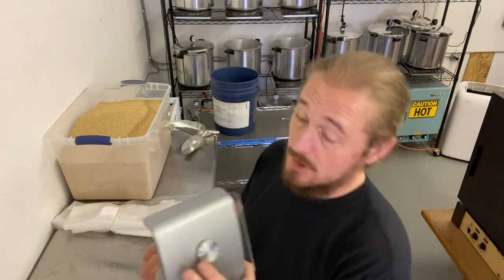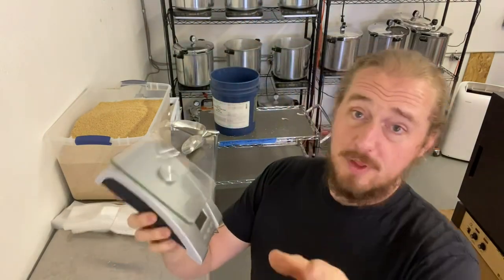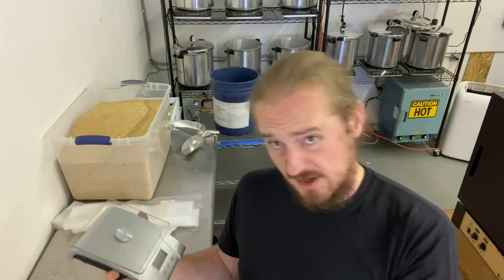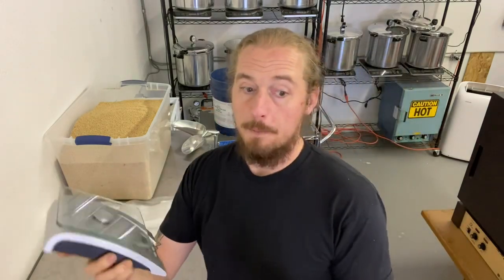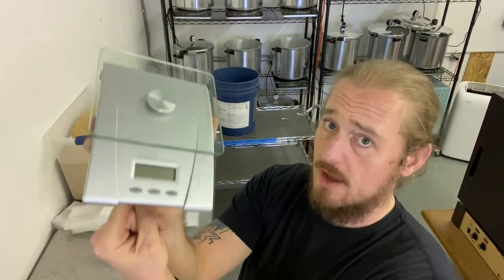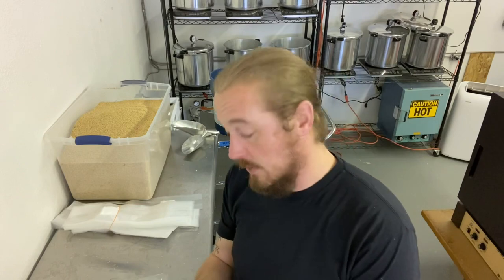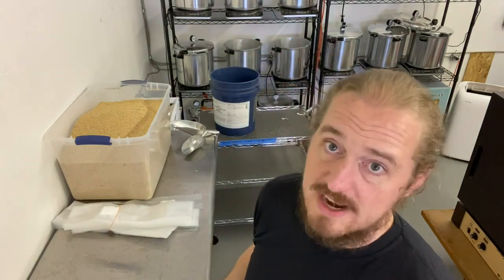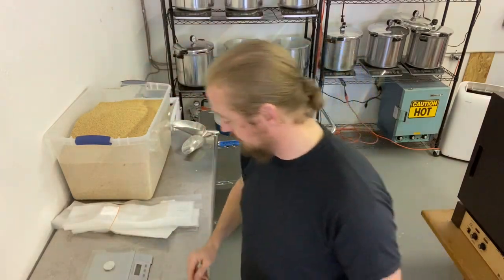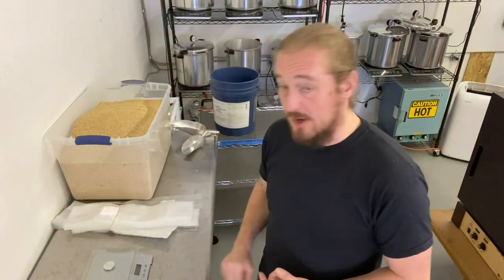Scale. Hopefully by the time you're employed with us, I've gone and spent actual money on good scales. But until then, we have this. This is the power of greyscale. Turn it on, set it to grams, tare it out - reset it to zero.